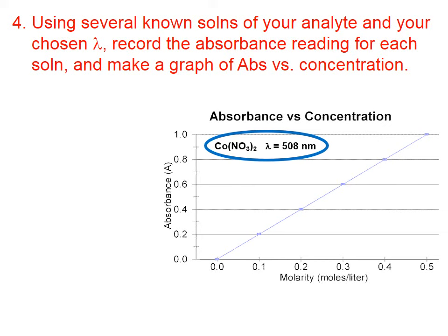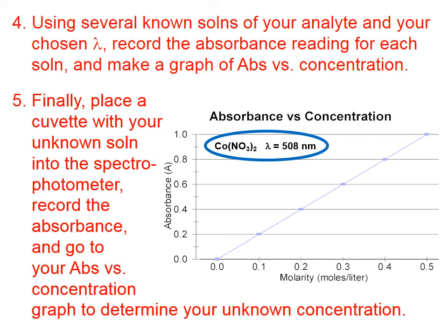Finally, place a cuvette with your unknown solution into the spectrophotometer, record the absorbance, and go to your absorbance versus concentration graph to determine your unknown concentration. We take our unknown concentration solution of cobalt-2 nitrate, put it in the cuvette, run it through the spectrophotometer, and it gives us an absorbance value. Let's say it's 0.5 — that means the concentration of our unknown solution is going to be somewhere around 0.25 molar.